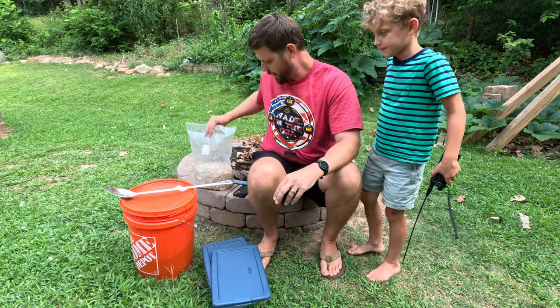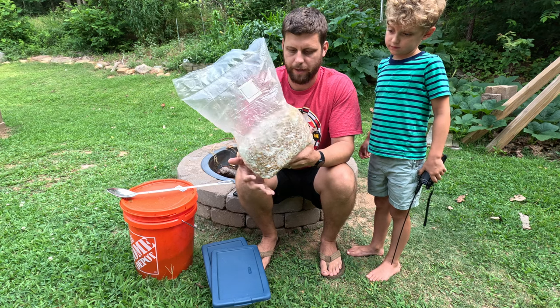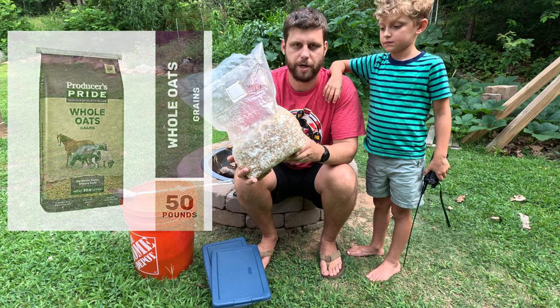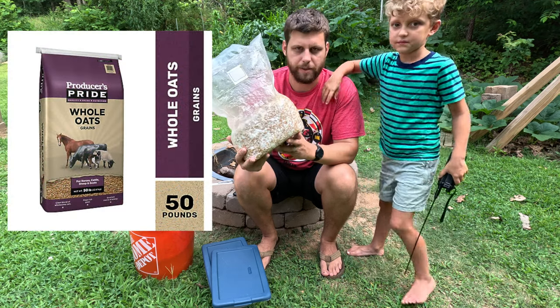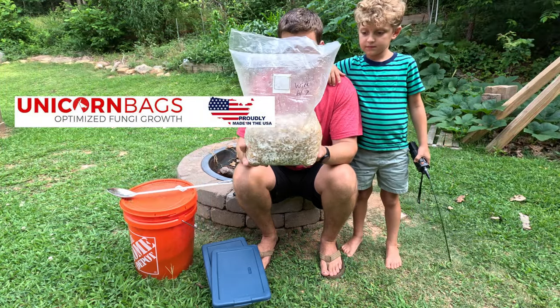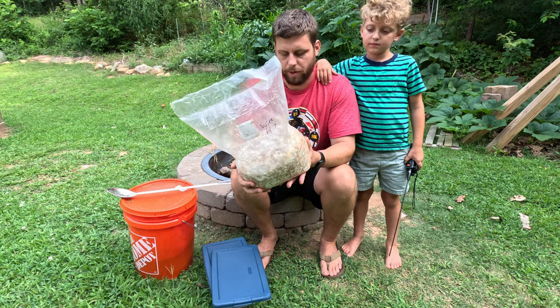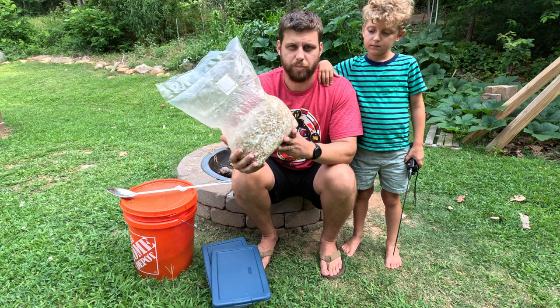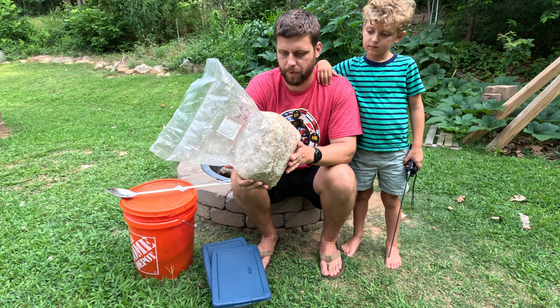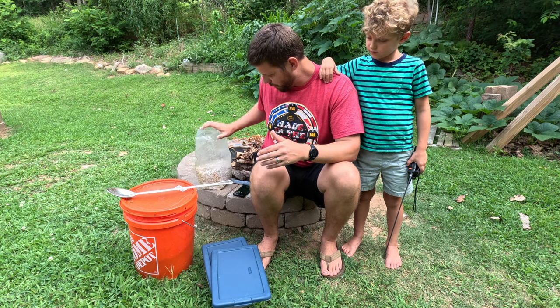Today we're going to start an experiment with growing some wine cap mushrooms. I have some grain spawn that I made from a liquid culture I ordered online. These grew on whole oats from Tractor Supply — I just sterilized the whole oats in the bag, then inoculated it with the liquid culture. It's been growing since June 7th; today is July 18th, so a little over a month, though it was ready probably a week or two ago. It takes about a month. We're going to use this to inoculate our cocoa coir media.